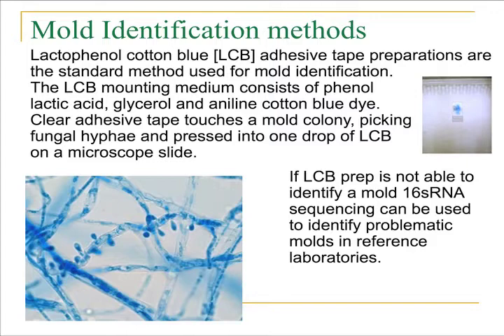In the lactophenol cotton blue prep, you put some mounting media on a glass microscope slide, and then you use clear adhesive Scotch tape, and you touch the mold on the extending hyphal portions, get a good array of fungal hyphae onto the Scotch tape, and then press that into the lactophenol cotton blue on the microscope slide.